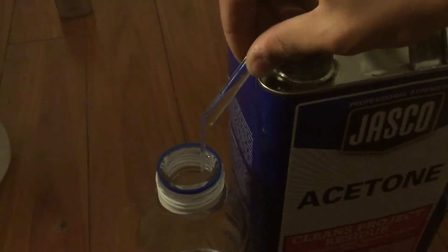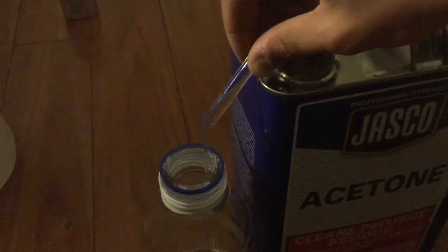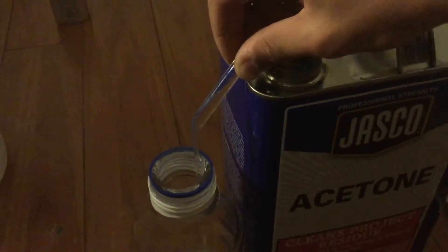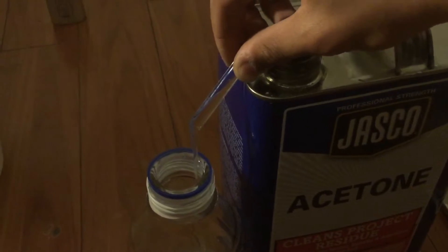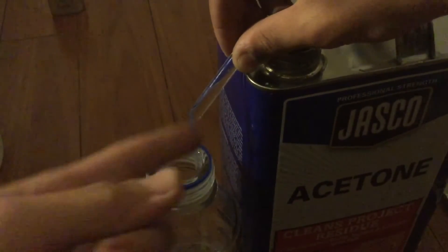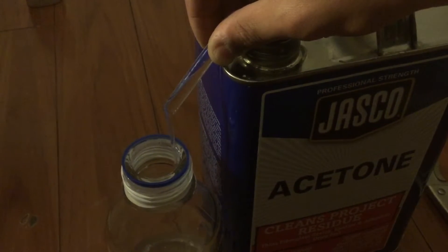My glass tube doesn't reach in completely, but that's fine because once it's around halfway full you can just pour it without it dribbling everywhere. When you want to stop it from siphoning out, you can just tip the glass tube back, which I'll demonstrate when I fill this glass bottle full of acetone.